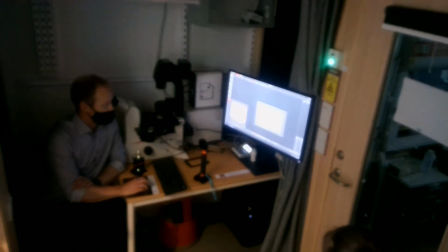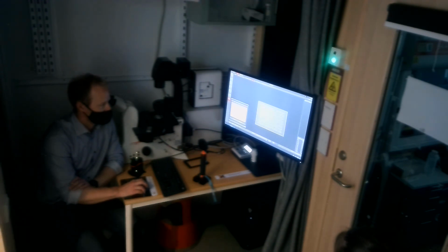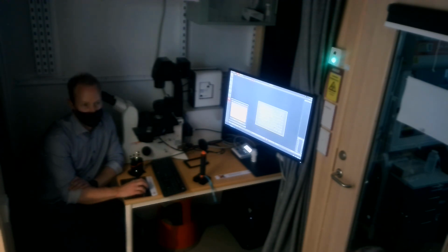You can also, of course, not use the set focus point there, and instead just use this tool here. Oh wait, first I have to remove all the ones that were set automatically. And if this is a perfectly flat dish, this could be enough. Most likely you would need a few more. But yeah.